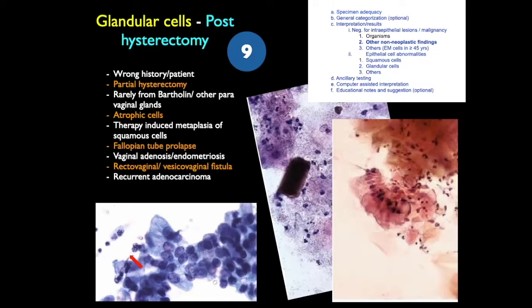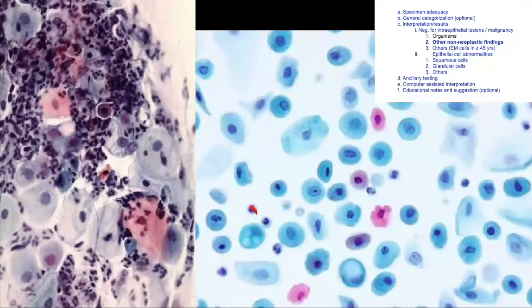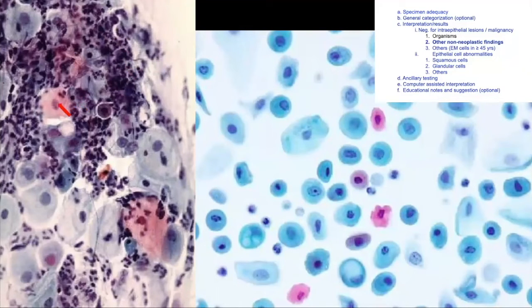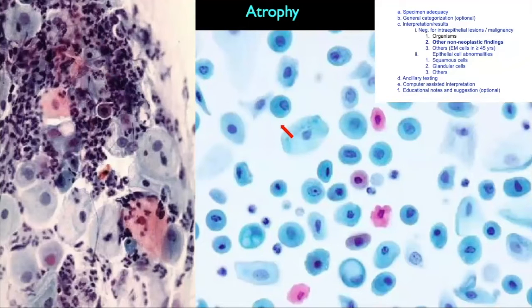Here you see metaplastic cells that are pink and parabasal cells that are predominant. In addition, they show pseudo-orangeophilia and perinuclear halo along with inflammatory cells — this is atrophic vaginitis. Another image shows only atrophy without inflammation.